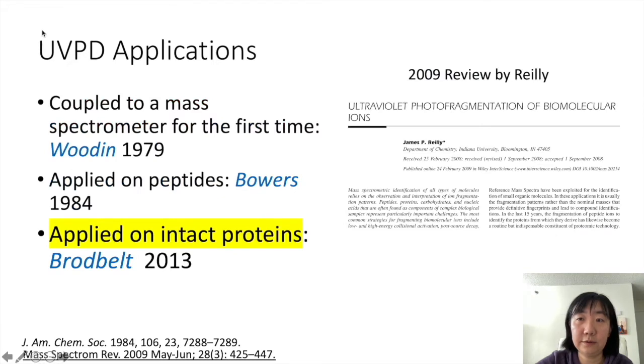Next, I'm going to introduce UVPD by its applications. A UV laser was first coupled to a mass spectrometer for photodissociation over 3 decades ago, in 1979.